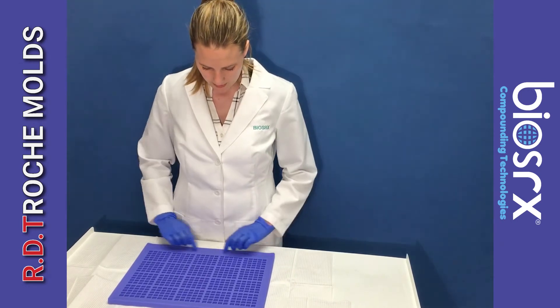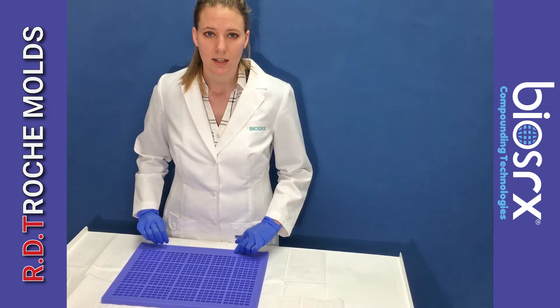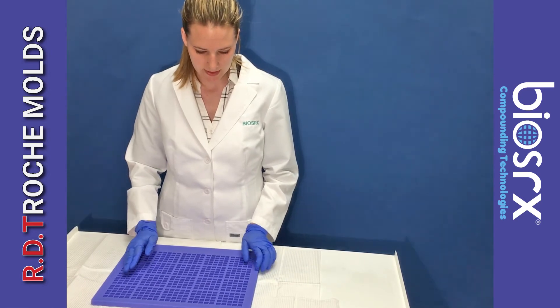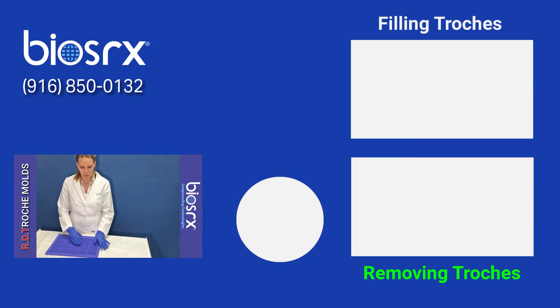As well as this trough here, which is a nice area to collect your excess base. When you're spreading your base across the mold, it's really easy to run it off the sides with more traditional molds. But with this, it'll always stay on your mold and you can just scrape the excess into this trough here.